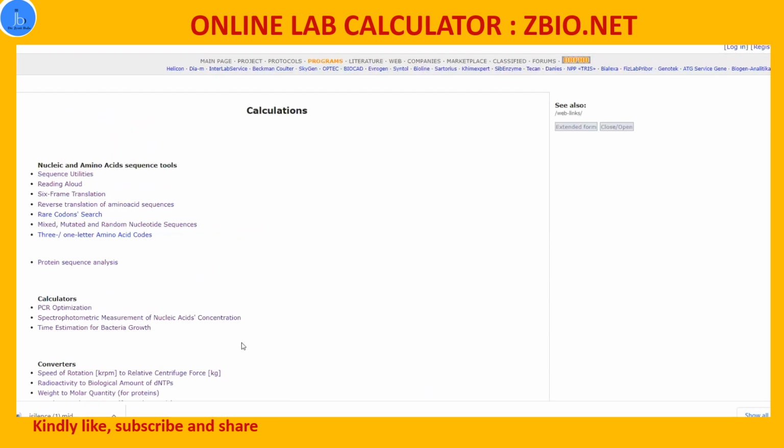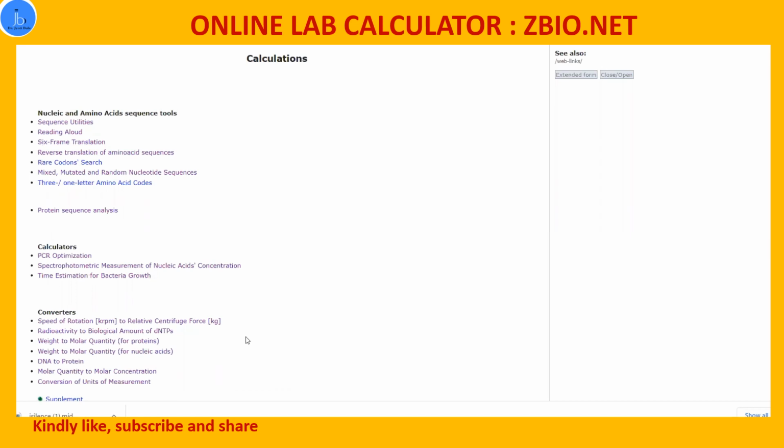So I hope you will come to this page and try this calculator. It is very easy, and if you are a student or young researcher who is doing these kinds of tasks, I hope this will be useful for you. Give it a try.